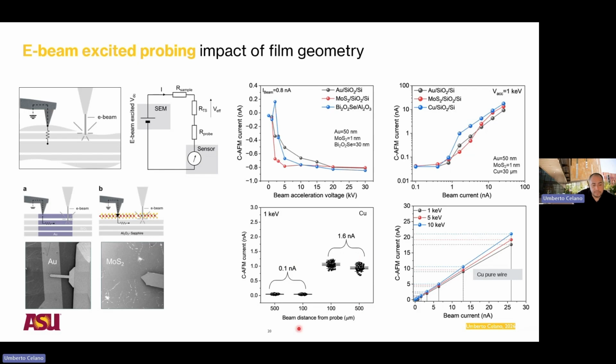And finally, for the beam distance, again, these are massive beam distances from 500 to 100. But again, you can appreciate the fact that even with 500 micrometer distance, using a small amount of beam current, we can get a very distinguishable signal-to-noise ratio, which essentially suggests you can keep the operating condition pretty mild, at least as concerns the in-plane transport.